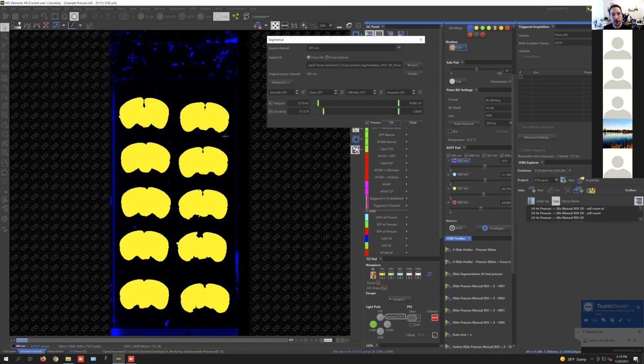And so these tools are much better than using just standard threshold and things like that, because they're more robust. So we've trained these on very low intensity, very high intensity, no labeling, of just neurons rather than a global marker like DAPI. And that really helps you to use these segmentation and imaging tools in a more reliable manner.